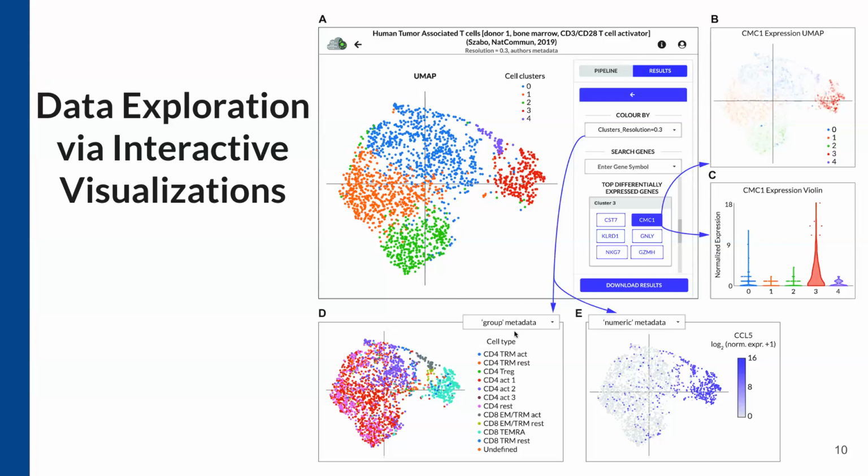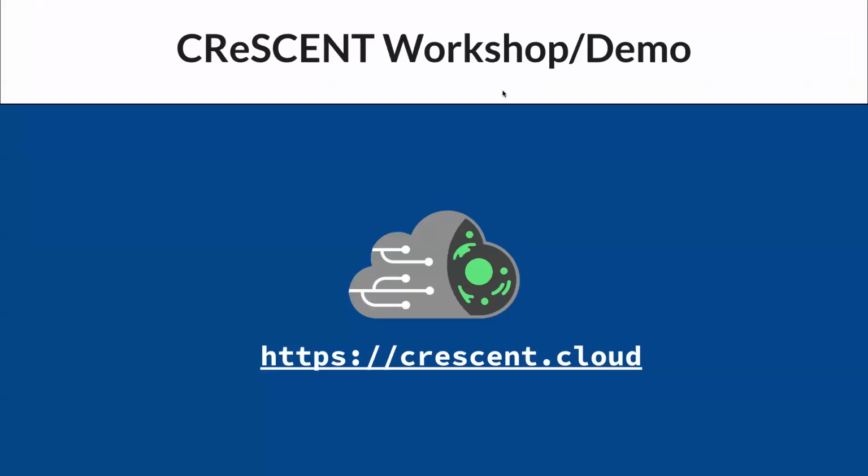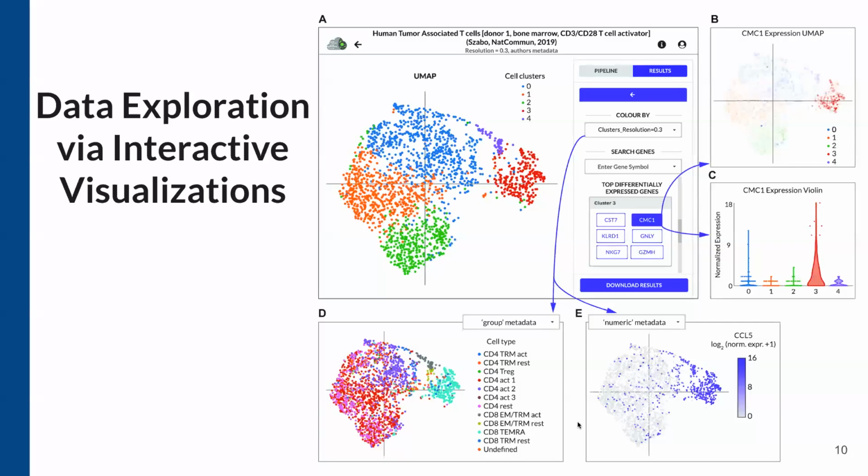So if we have our own cell labels, for example, here, this data is coming from a Nature Communications paper, and the authors had labeled cells. So we are able to visualize them as the authors wanted them labeled, or, if you're bringing in your own data, then you might have your own self-filtering that happens experimentally.